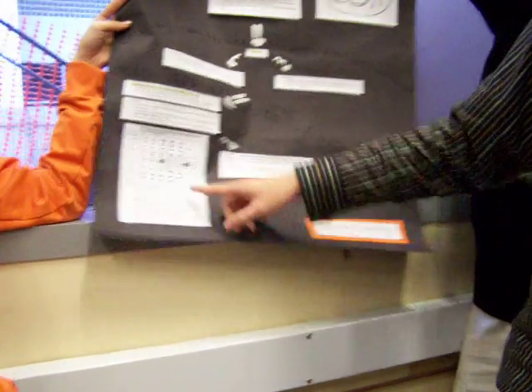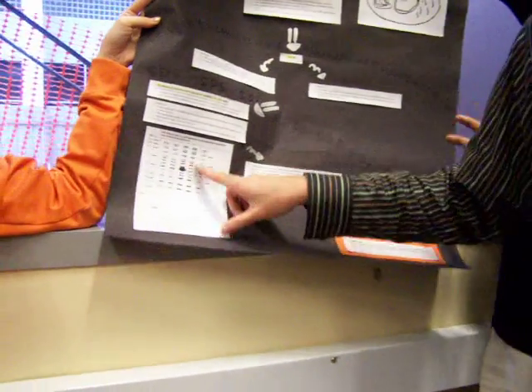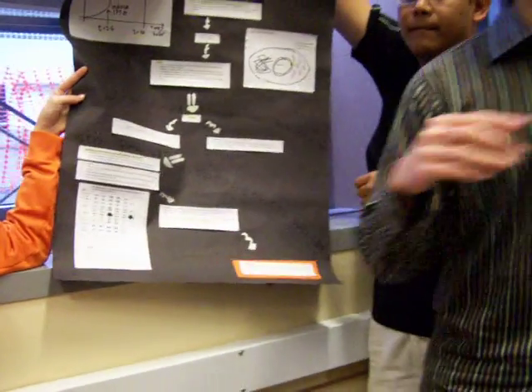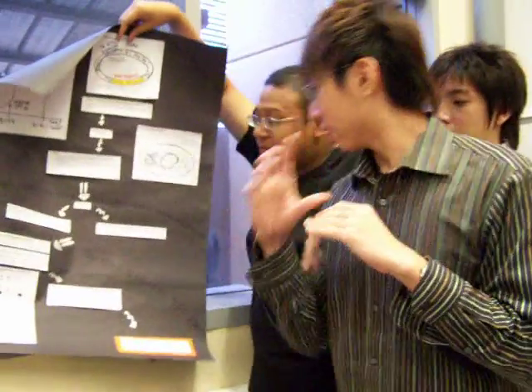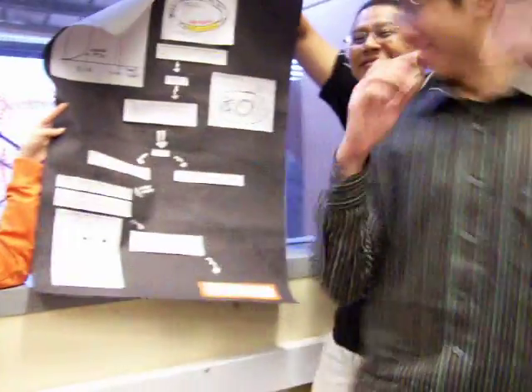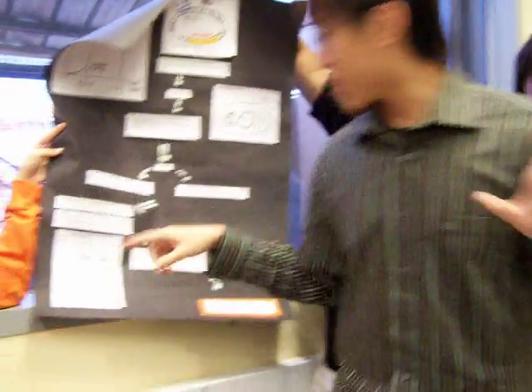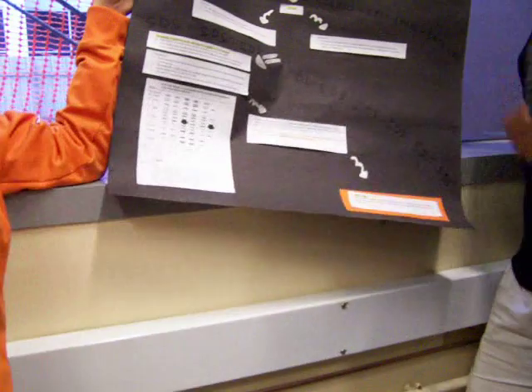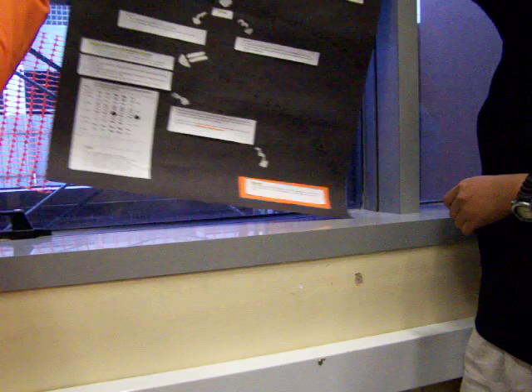And you can see there are 2 extra lanes here, lane 6 and lane 7. They did SDS-PAGE on the pellet and the supernatant. Lane 7 is the pellet, lane 6 is the supernatant. And the fat protein is present in the pellet. So this tells us that the fat protein is insoluble.